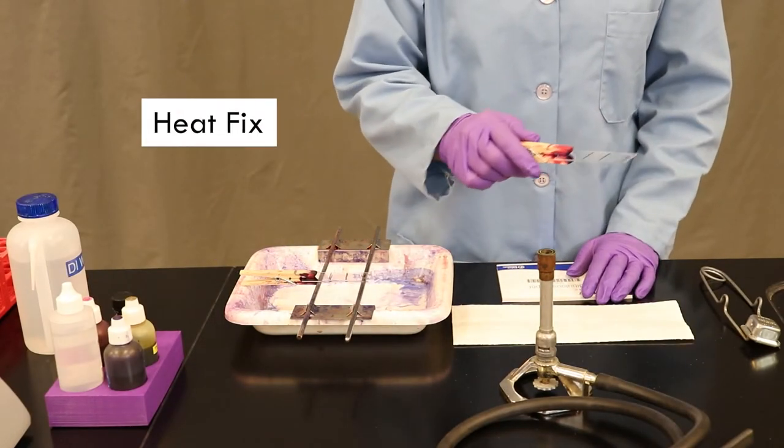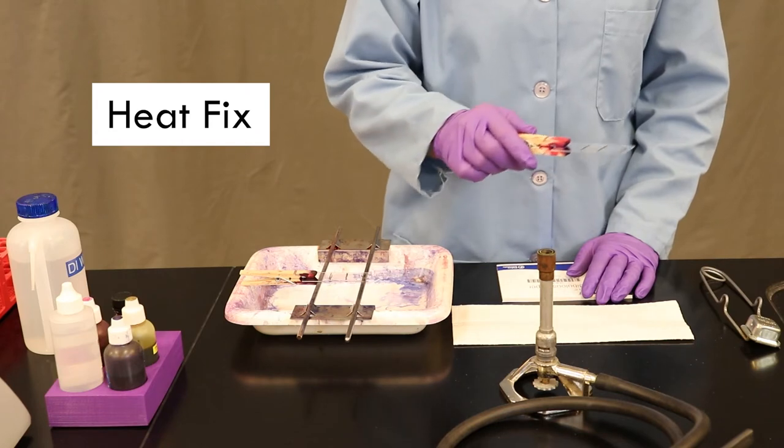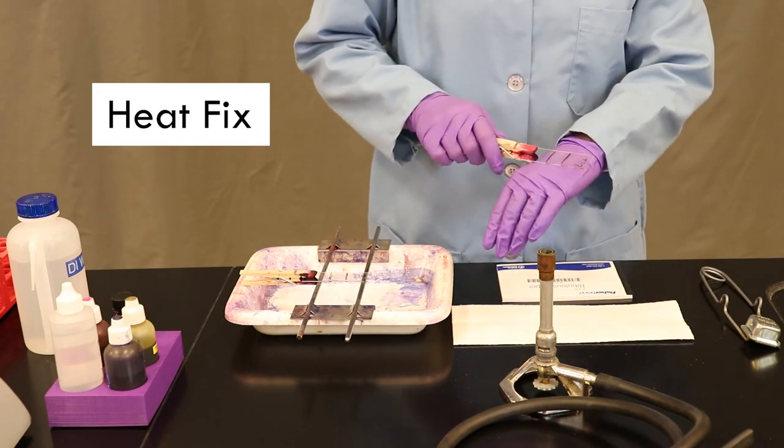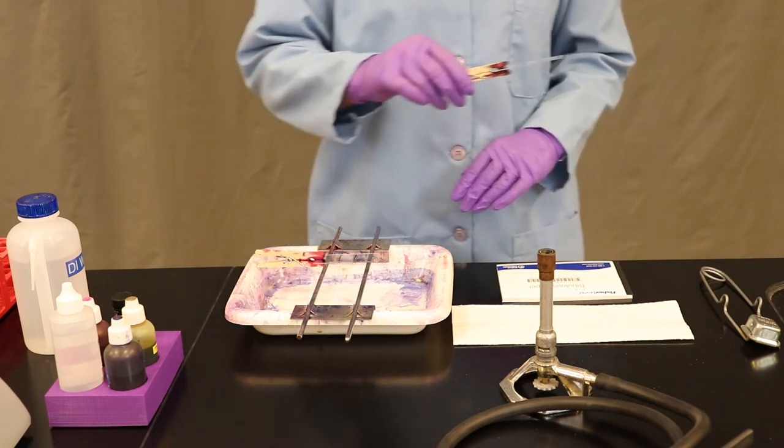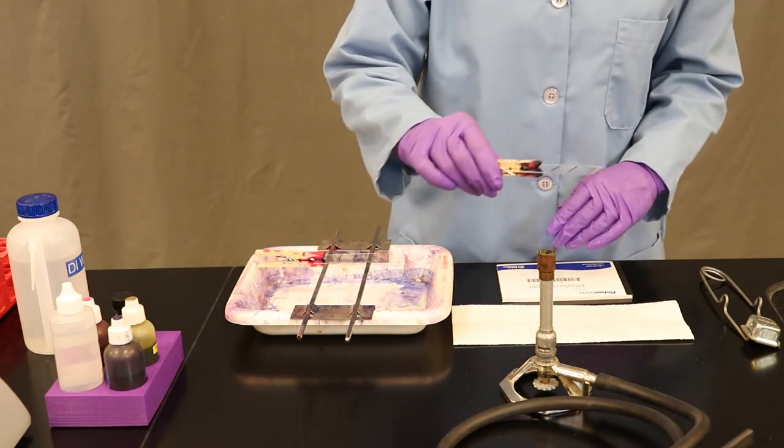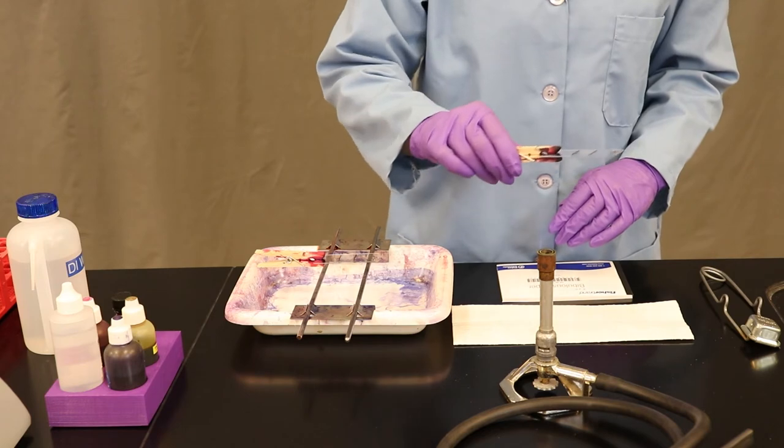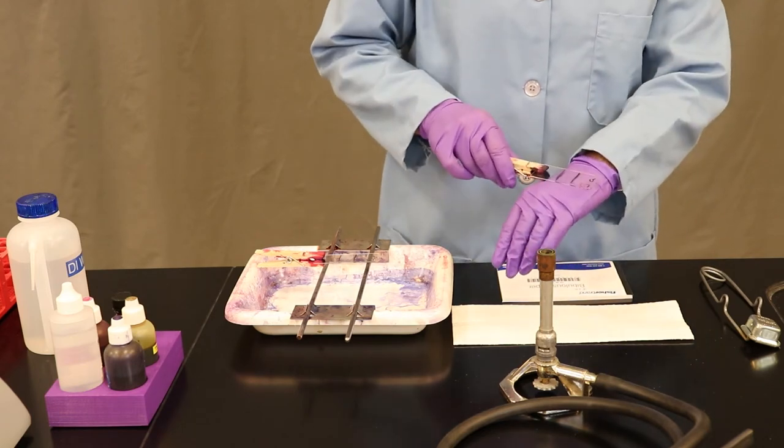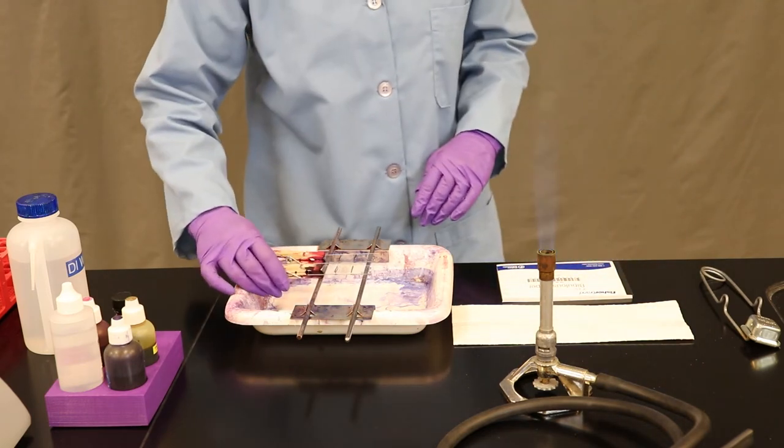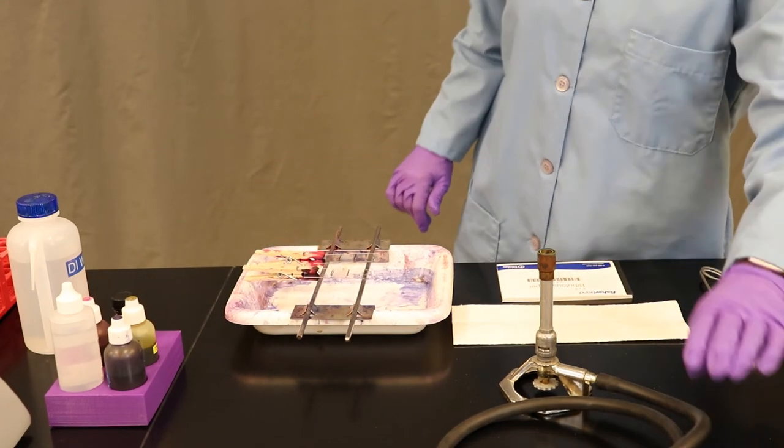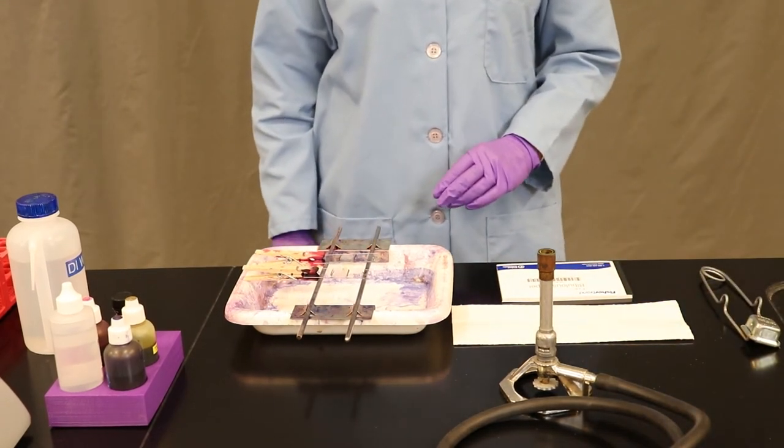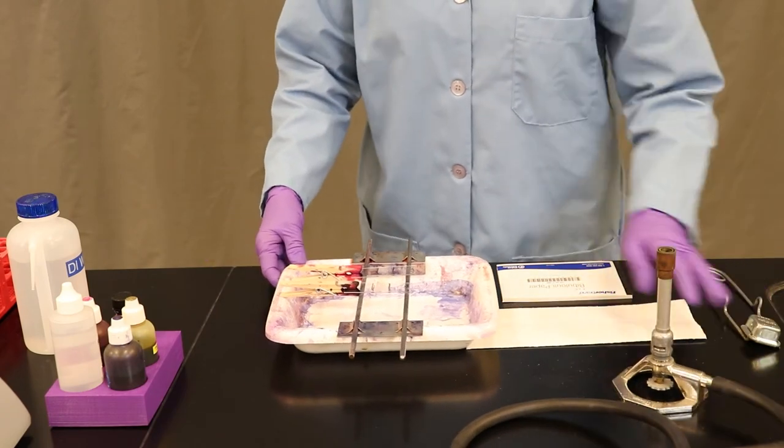The next step is to heat fix. We heat fix by using a clothespin and passing the glass slide through the flame several times. You'll notice here that what we're attempting to do is kill the bacterial cells and adhere them to the slide. The slide should be warm, but not hot to the touch. Once you're finished with your heat fix step, you're done with your Bunsen burner.